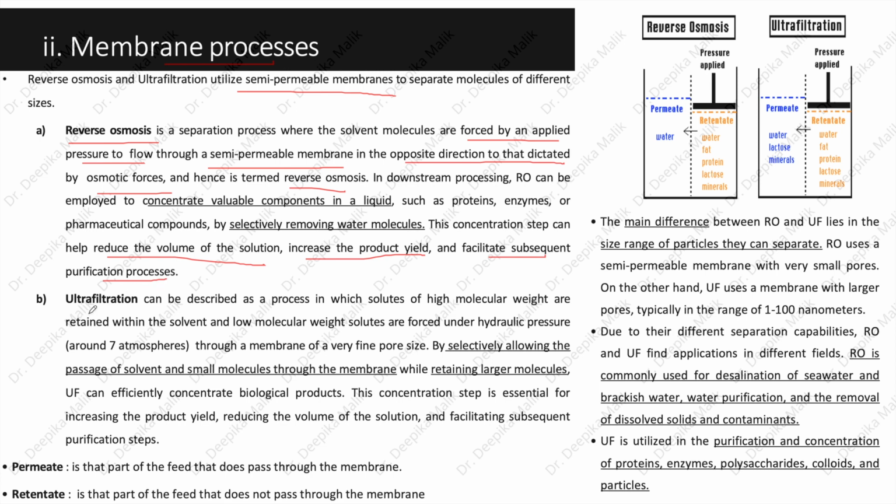On the other hand, ultrafiltration can be described as a process in which solutes of high molecular weight are retained within the solvent and low molecular weight solutes are forced under hydraulic pressure around 7 atmospheres through a membrane of a very fine pore size.